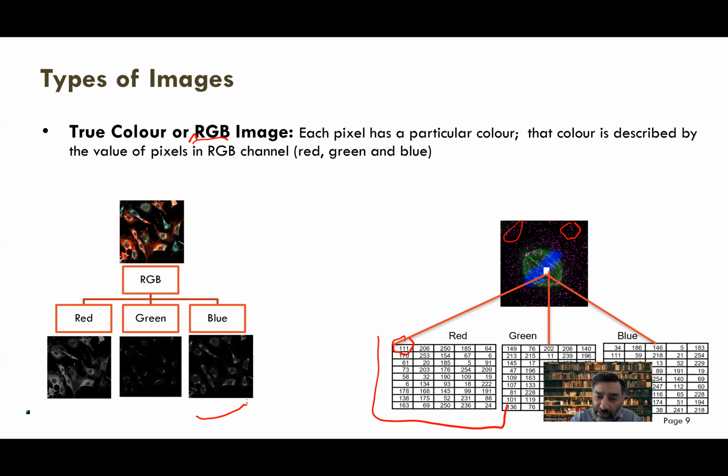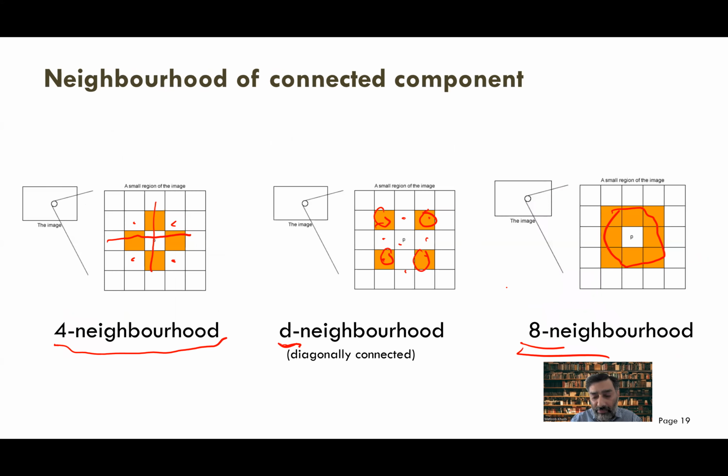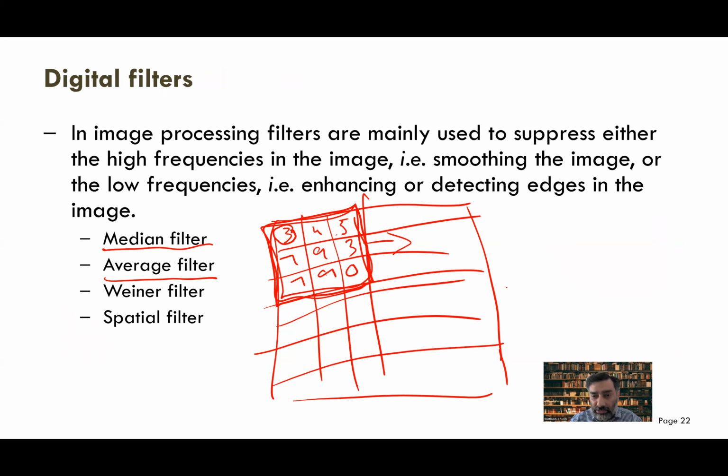So I defined an area of interest, and then worked out the thresholding just within this area, and ignored everything else. If you have a complicated background, this is what you can do.